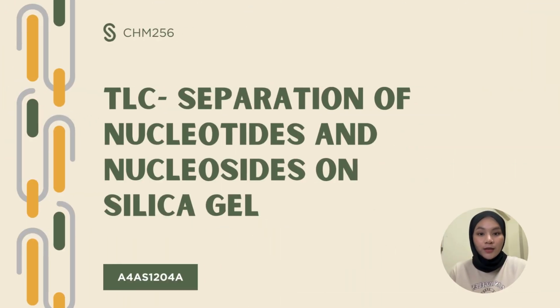Assalamualaikum and hello everyone. We are students from UiTM Tapah, and in this video we will be presenting a topic from the CHM256 subject. The topic that we chose is paper chromatography, but our main topic is thin layer chromatography, separation of nucleotides and nucleosides on silica gel.